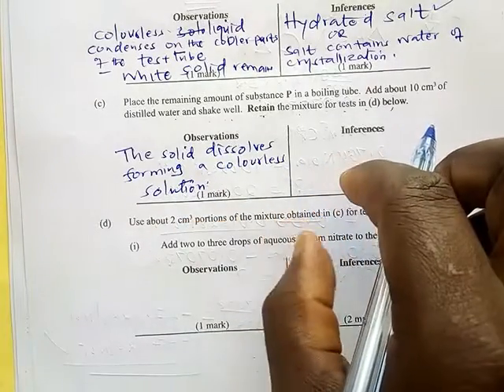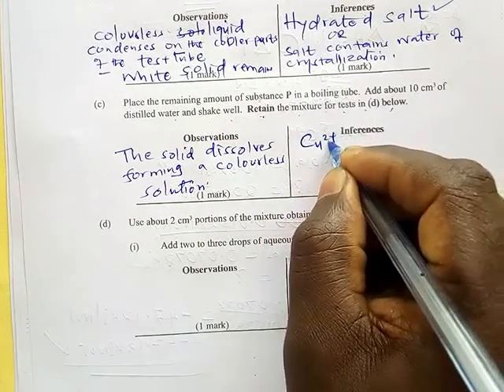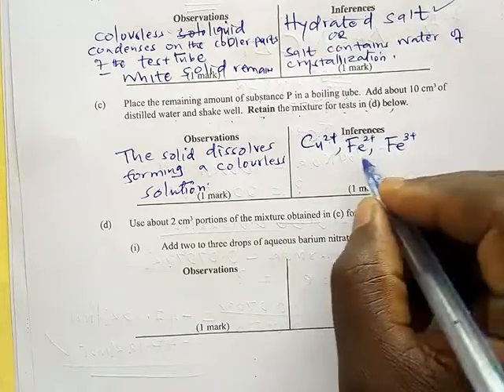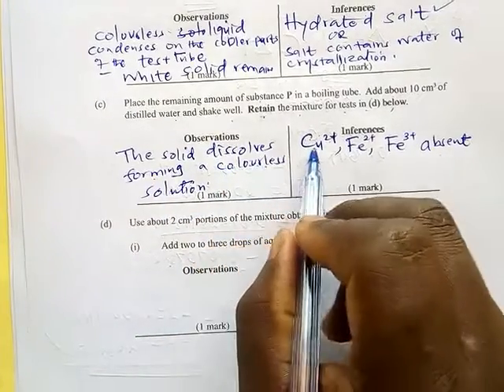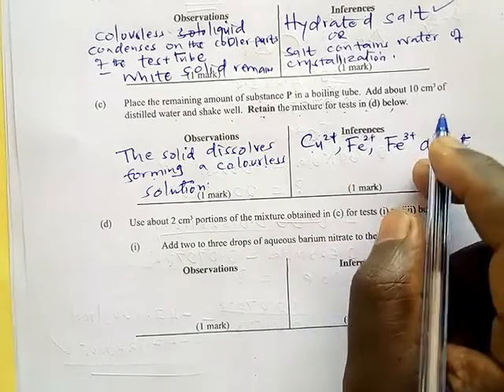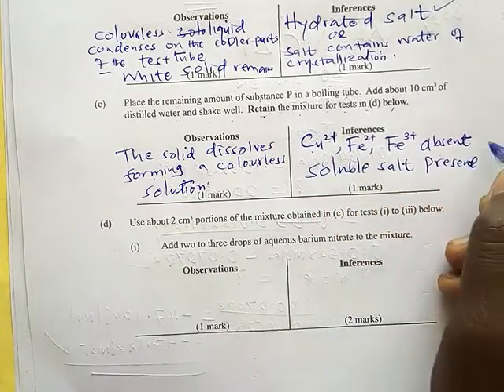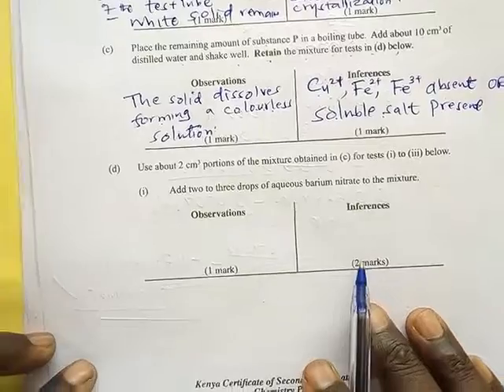That tells you that the colored ions are absent, and we know the colored ions: copper 2 positive, which is blue, iron 2, which is green, and then iron 3, which is brown. They were absent because it formed a colorless solution. Therefore these ones were absent. It is also acceptable if you forget this, you can write soluble salt present. It is acceptable.